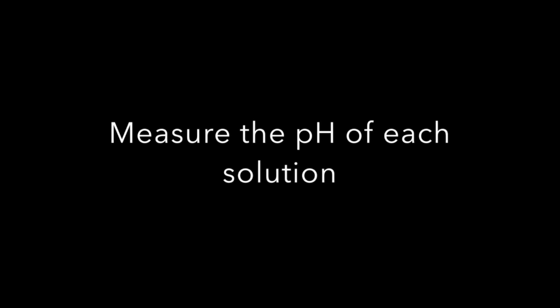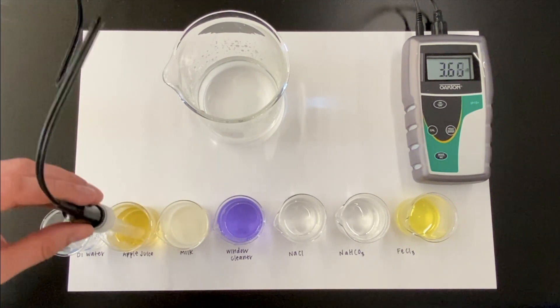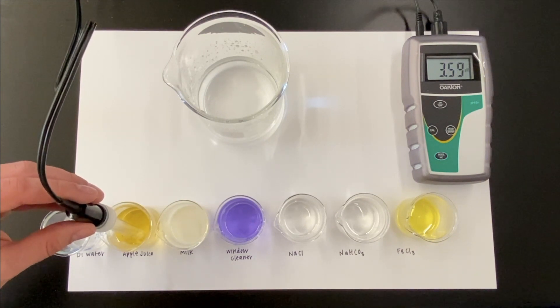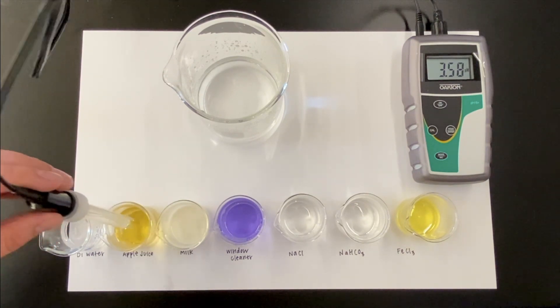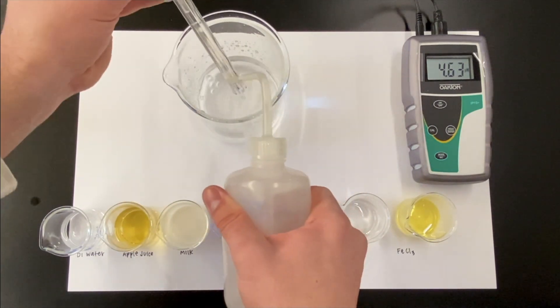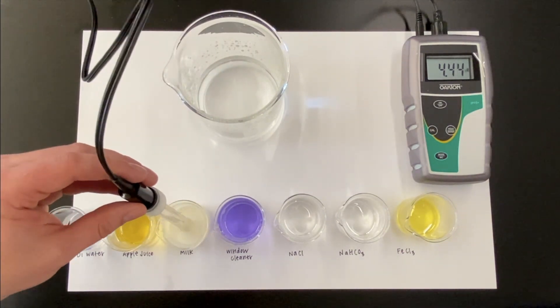Moving on to step five, we're now going to use our pH meter and electrode to determine the pH of each solution. We actually missed taking the pH of water — it was about 6.70, so make a note of that. Now we're moving on to apple juice. We wait until it stabilizes, then get the reading. It's really important that you rinse off the electrode every time so you don't carry over any solution from the previous one — just good lab procedure.